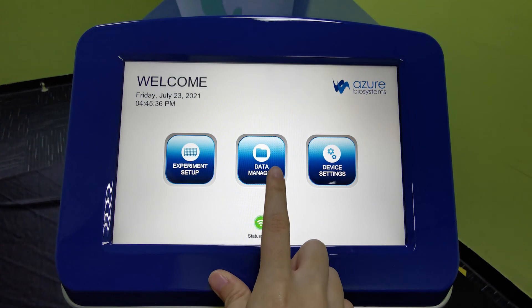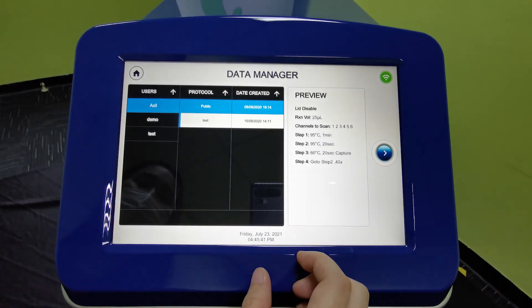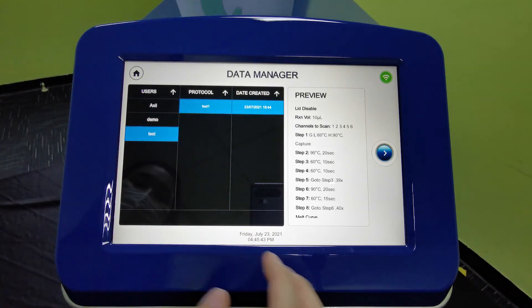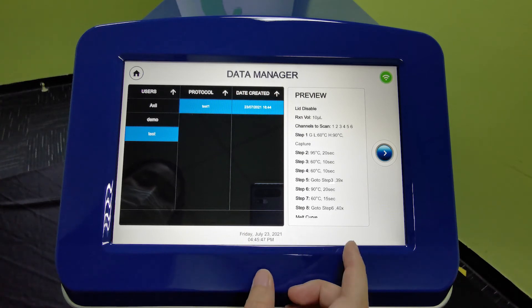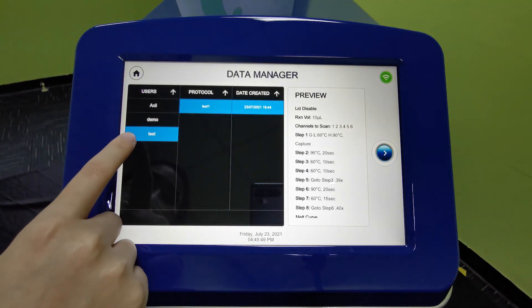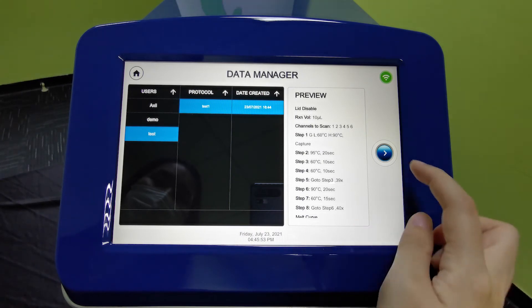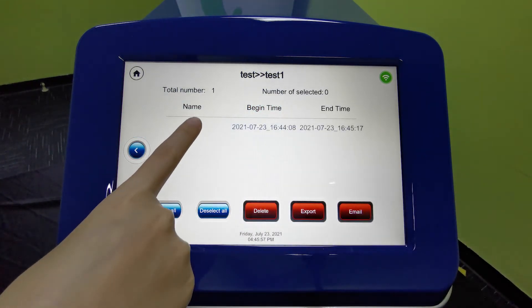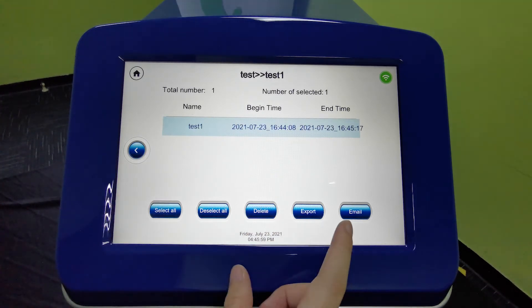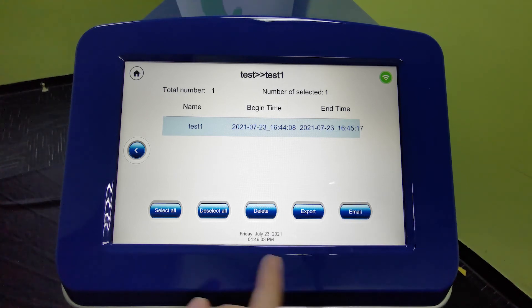Under Data Manager, you can preview previous experiments and export old data to your USB drive or via email. Under the test we created, you can preview the steps that were set up, then click next to see the experiment that was run, and click export or use the email function to send the data.